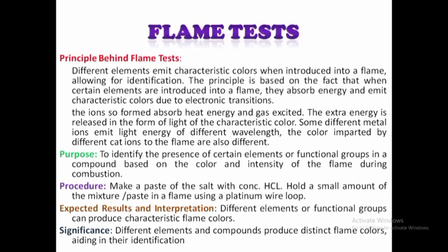As I discussed in the class, different elements emit characteristic colors when introduced into a flame, allowing for identification. The principle is based on the fact that when certain elements are introduced into a flame, they absorb energy and emit characteristic color due to electronic transition.